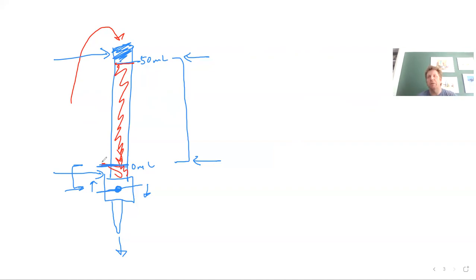This piece of glassware is a lot like a volumetric flask. It's very good for measuring 50 milliliters and measuring within the confines of this point and this point right here. If you go above that, you're not going to get an accurate measurement. If you go below that, you're also not going to get an accurate measurement, because you do not have any lines indicating the volume that's above nor below that 0 milliliters. So a very cautionary tale: make sure that you do not overfill it and do not let the solution run out completely. Okay, so that's basically what a Buret looks like.